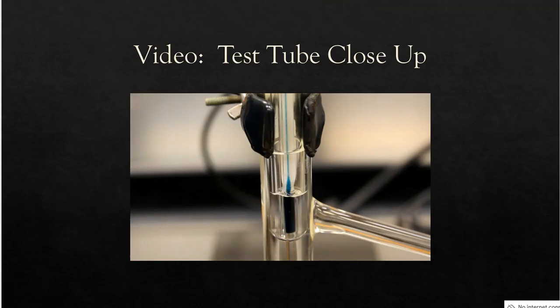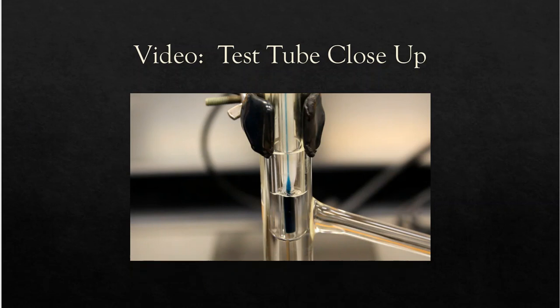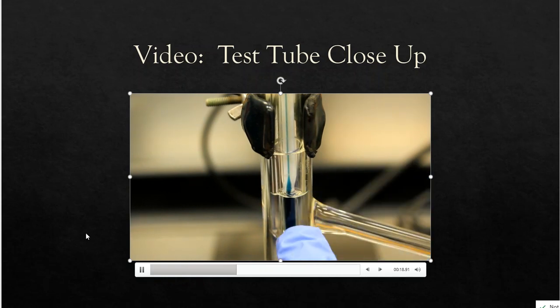All right, so here's another video. As you can tell, my sample is in that test tube, as well as my capillary and my thermometer. And this video just kind of shows you close up how this setup is going to start working. So I think this is a better close-up view of what's happening at the arm of the Thiele tube. And here you can maybe see the test tube that is submerged in the mineral oil of the Thiele tube apparatus. This test tube again has about 5 milliliters of my unknown here at the very bottom. It also has the upside down capillary that will create bubbles throughout this process.